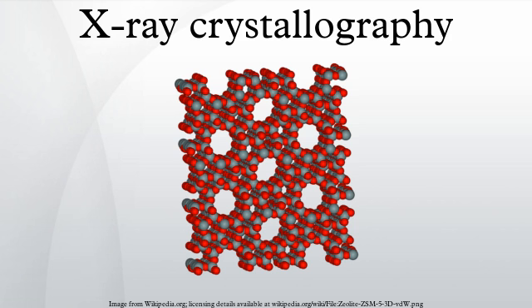A new model can then be fit to the new electron density map and a further round of refinement is carried out. This continues until the correlation between the diffraction data and the model is maximized. The agreement is measured by an R factor defined as where F is the structure factor.